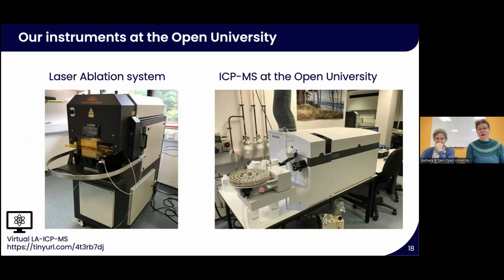And because we are at the Open University, which is famous for its long distance learning, a couple of years ago we, together with a researcher, developed a virtual laser ICP-MS, which allows you to tune and analyze some things and train a bit and learn more about laser ICP-MS. So if you're interested in that, it's free to visit.